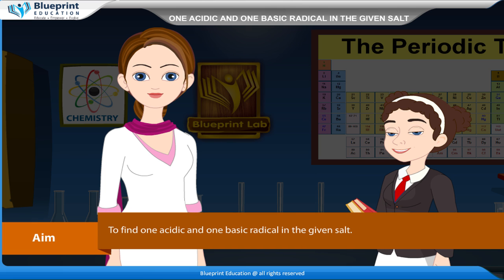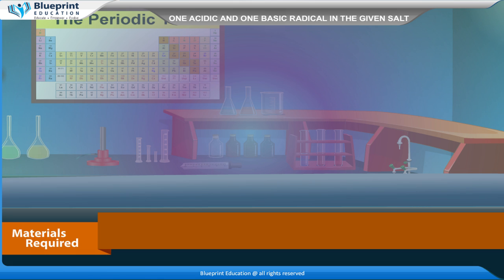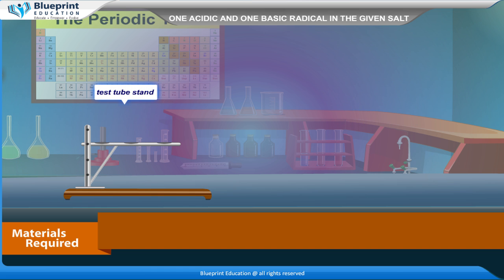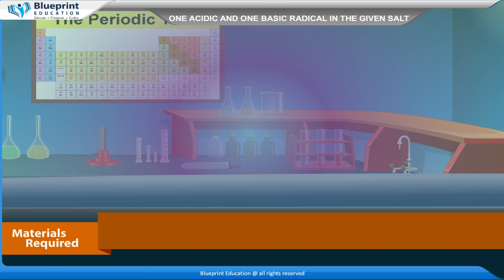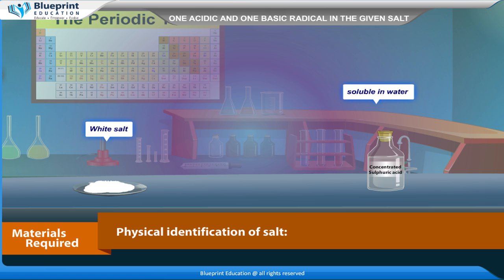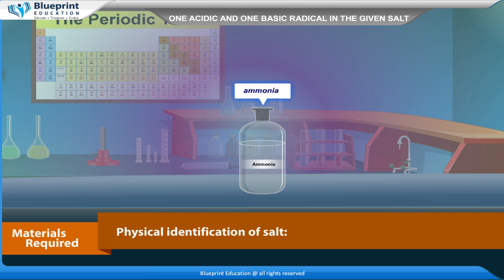Our aim is to find one acidic and one basic radical in the given salt. The materials required are test tube, beaker, test tube stand, glass rod, etc. Physical identification of salt: white salt, soluble in water, ammonia-like odor.